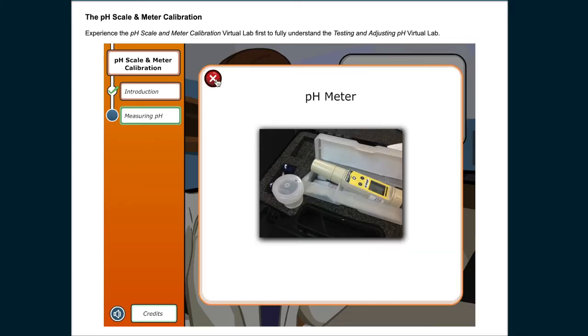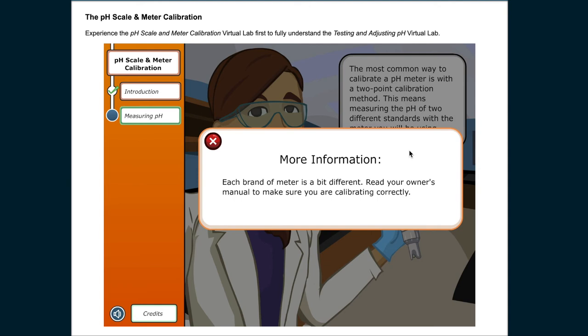pH meter. Each brand of meter is a bit different. Read your owner's manual to make sure you're calibrating correctly.